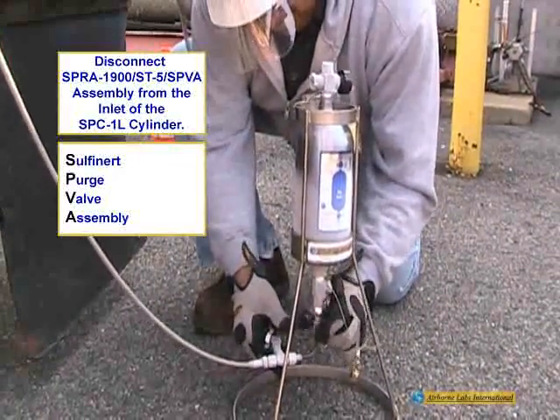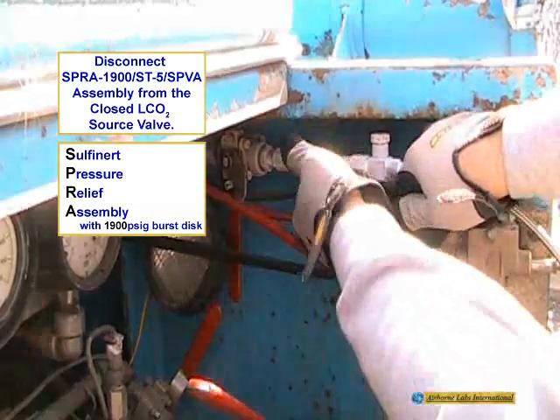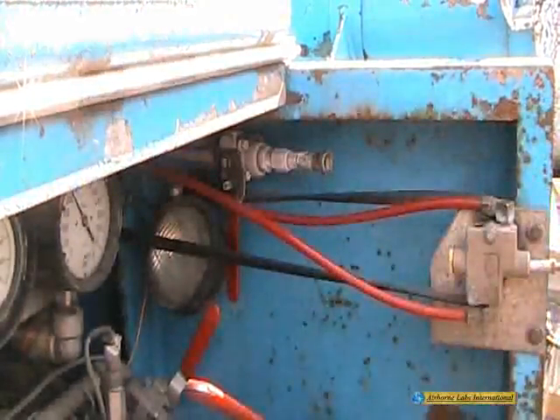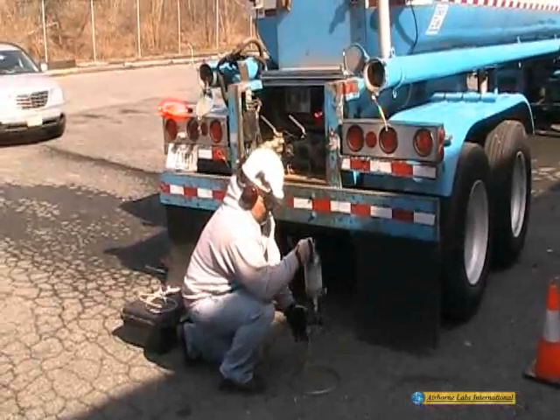Disconnect the entire transfer line assembly, first from the elbow fitting on the 1-liter cylinder inlet port and then from the liquid CO2 source valve. Do not allow the transfer line to contact the ground at any time. Close the purge valve, wipe off all surface moisture, and store the assembly in a zippered bag.